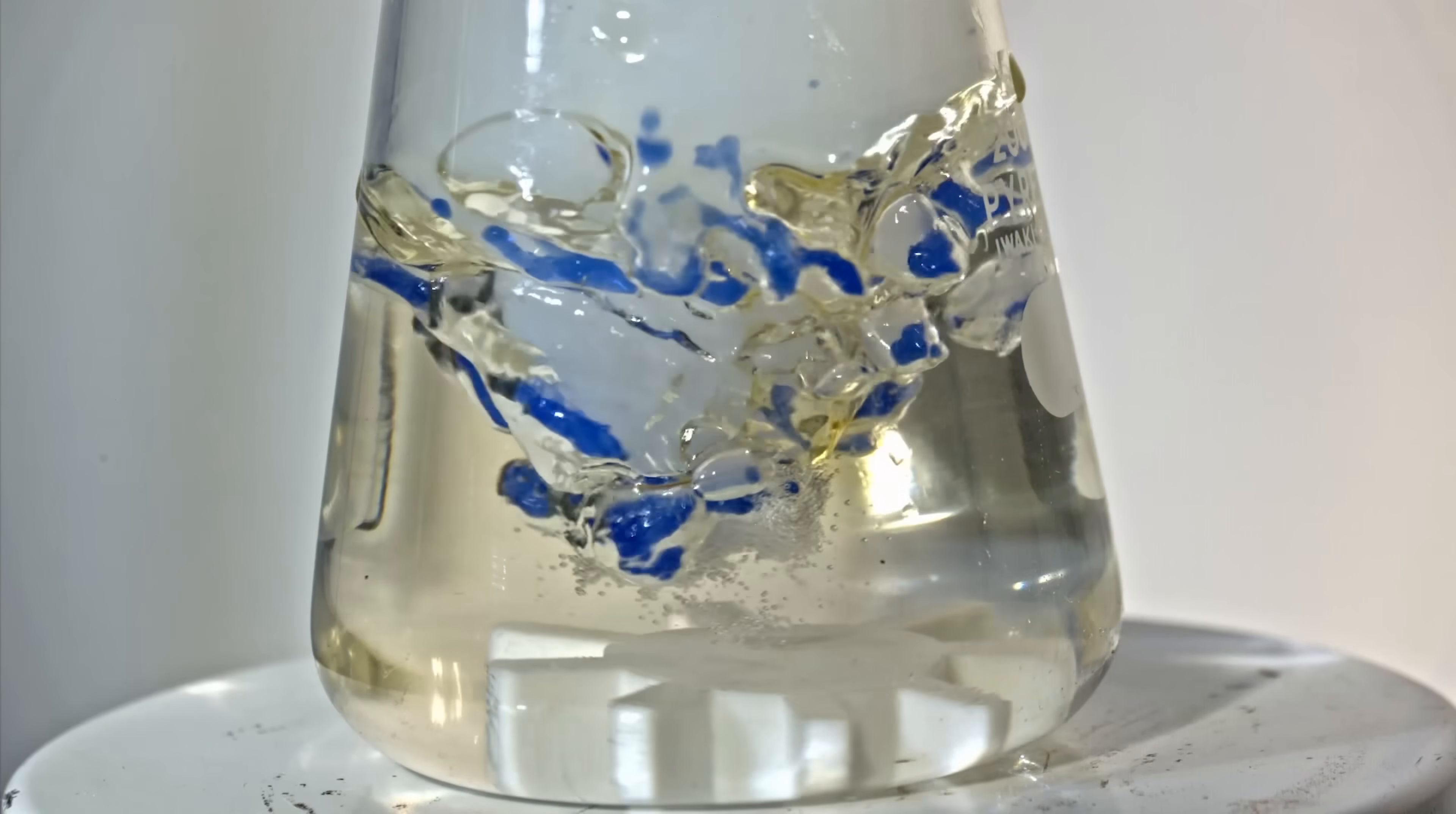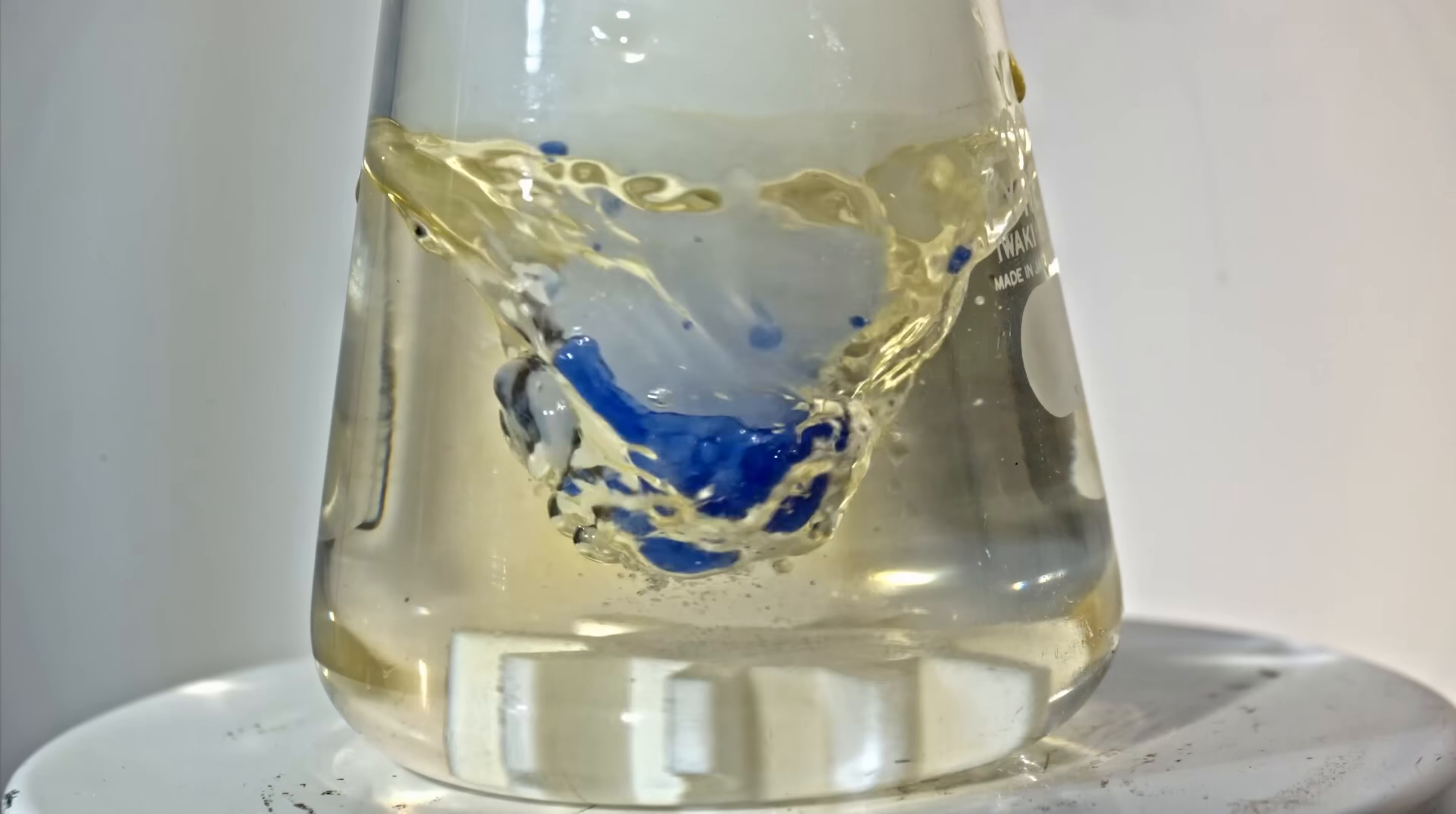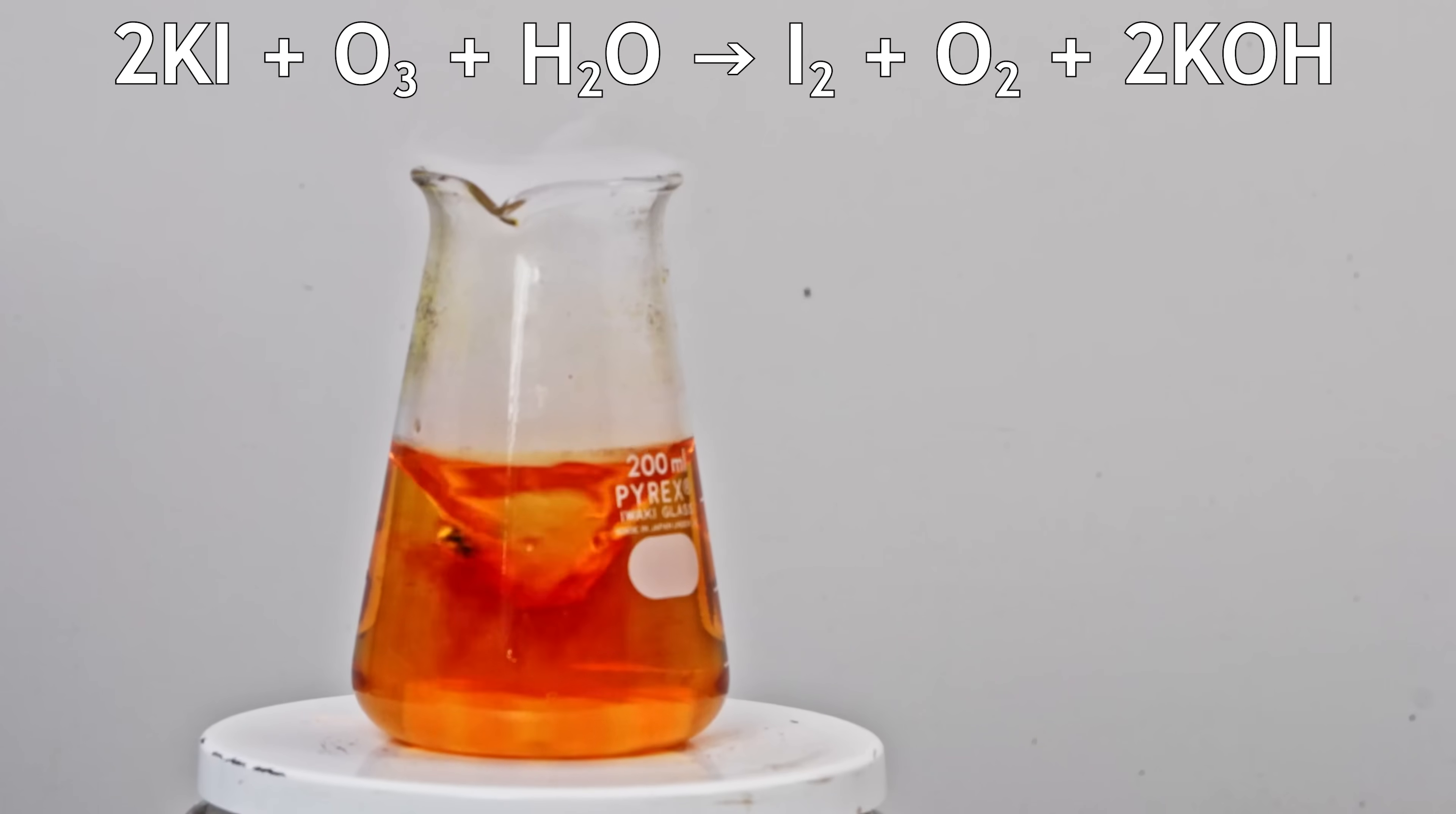Ozone oxidizes iodide ions into elemental iodine, which darkens the solution. Note that as oxygen evaporates and the ozone concentration increases, the amount of iodine released also increases. At the end of the reaction, when only highly concentrated ozone remains, the iodine release peaks, causing the solution to darken sharply.